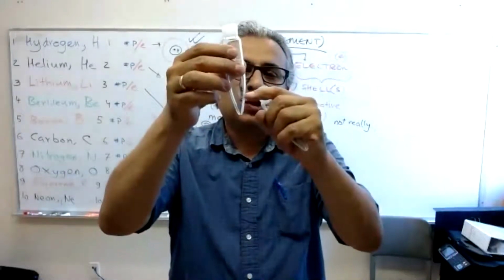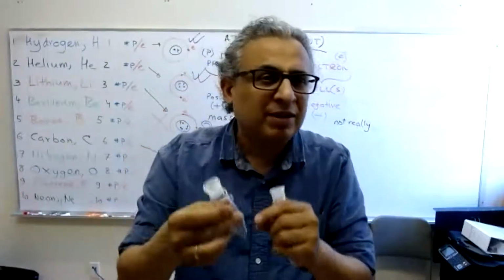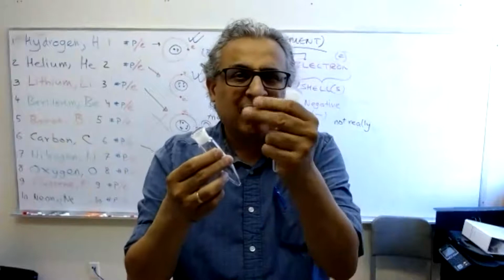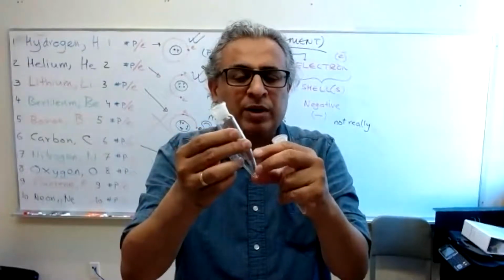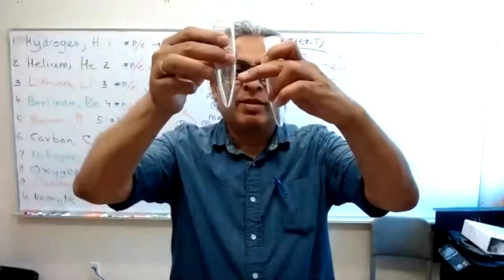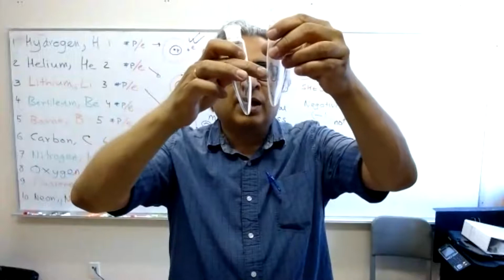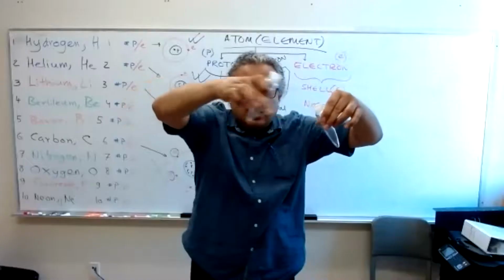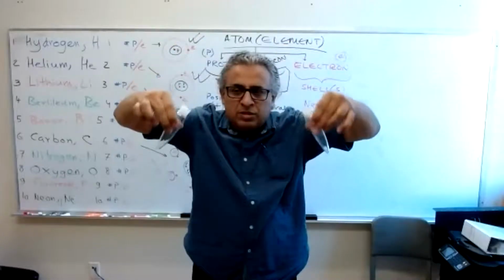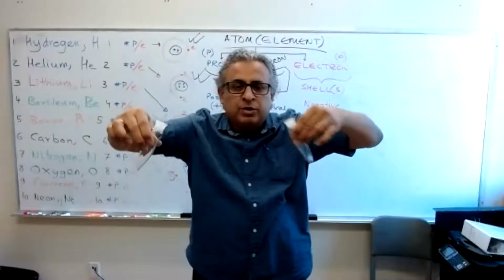When you have some solid mixed in a liquid and you can't separate them, you cannot filter them because it looks like a slurry mixture. You can't really filter. It's going to make a mess. It's too little quantity. So then you have one of those mixtures here. Then you put water or something in the other one to make sure they're balanced. You put them in a centrifuge where there's a round disc with holes to hold these centrifuge tubes, and you spin it.